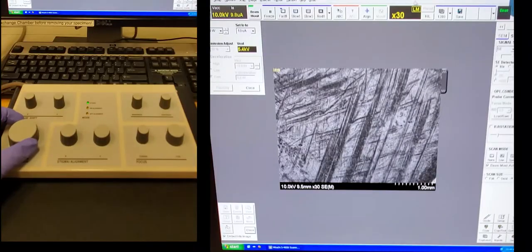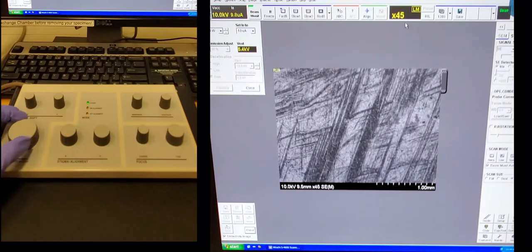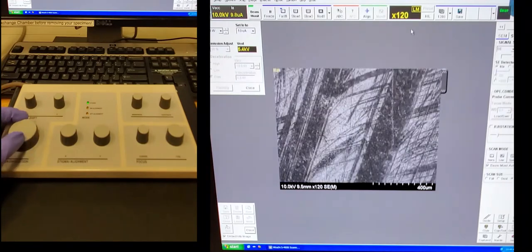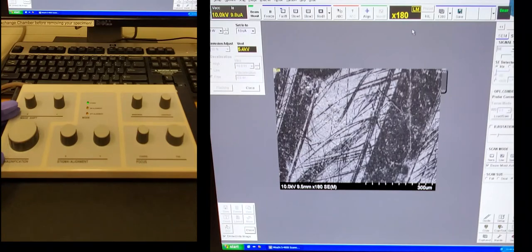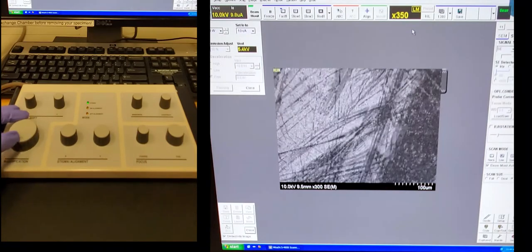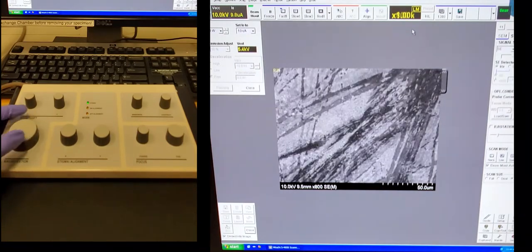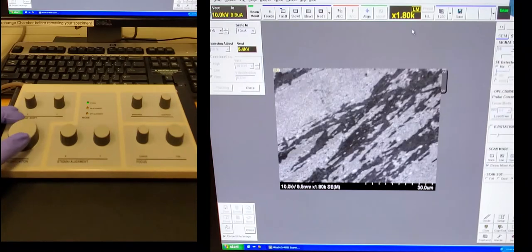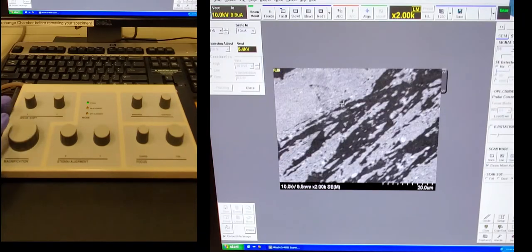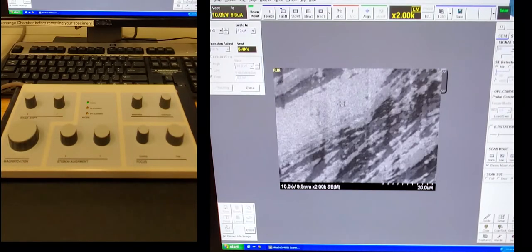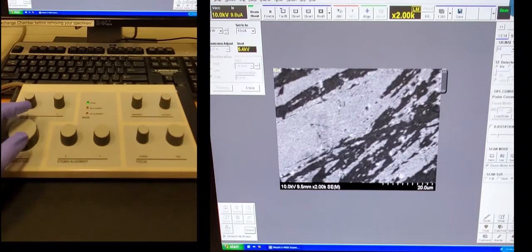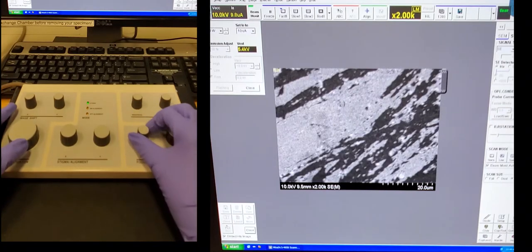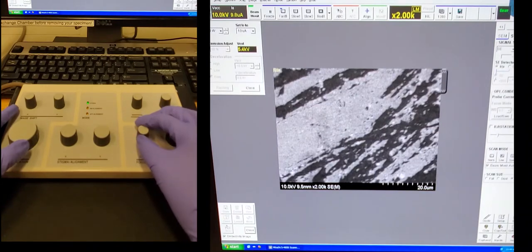This is a sample of gold nanoparticles, so we're going to just pretty much image anywhere that looks okay. So this large knob on the left is what you can use to magnify in, and you can see the number changing in the top black box at the top of the screen. You can only go so far in low mag though.